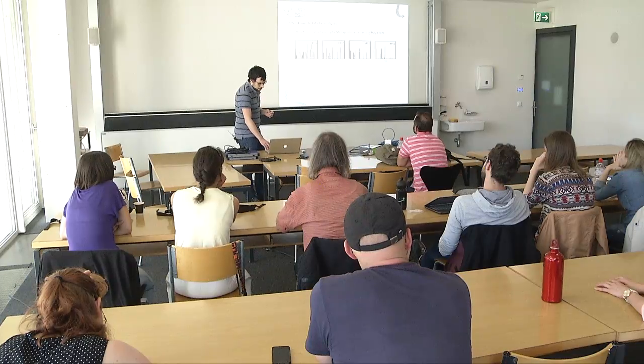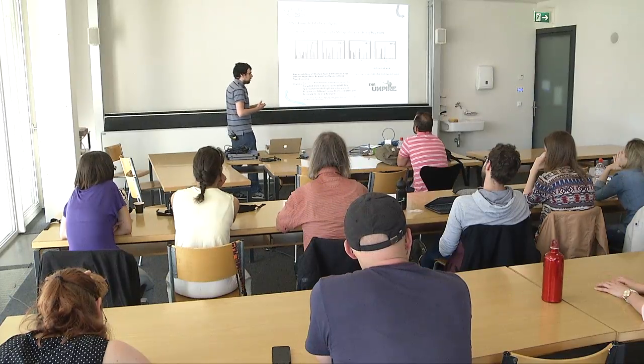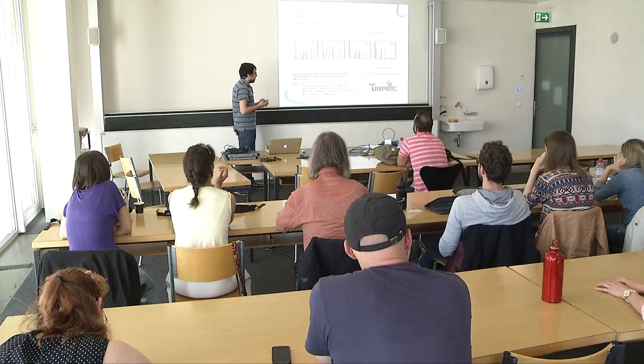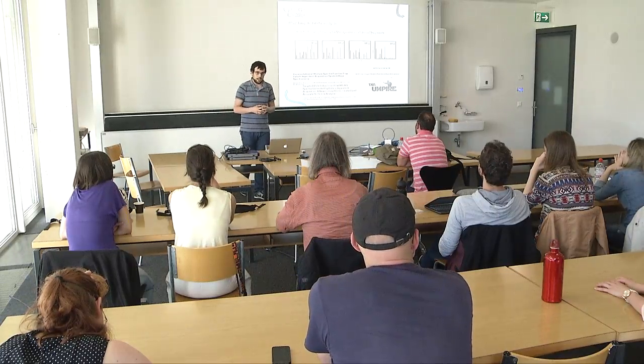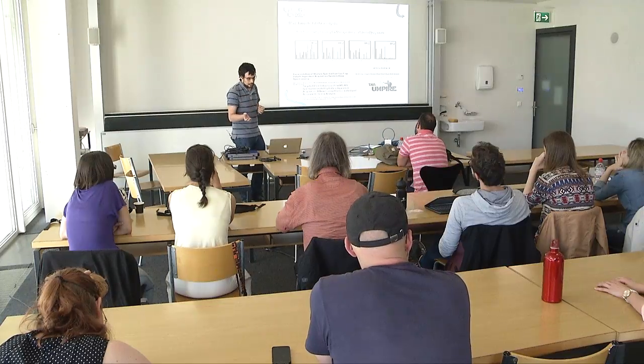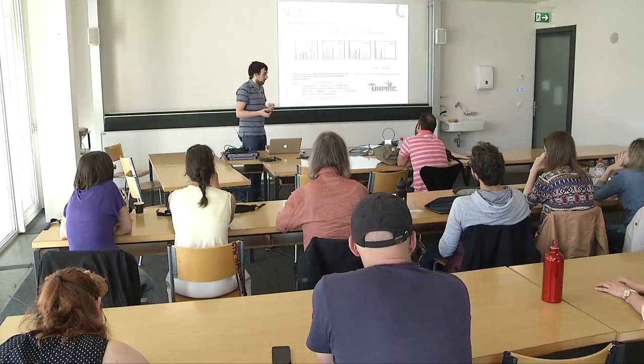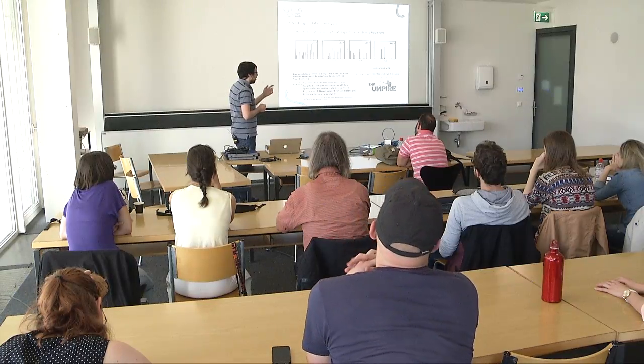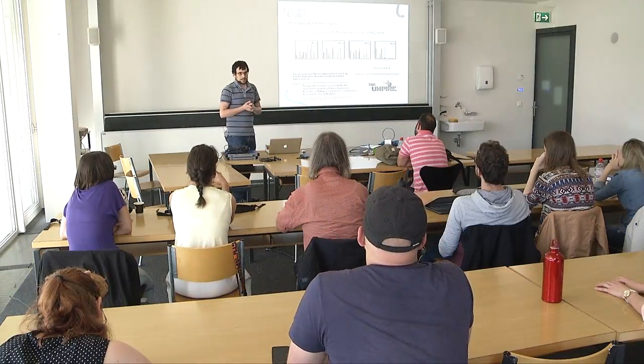And it has been mentioned, especially in Jared's presentation, that there are several ways of extracting this data, right? We have seen Skyline, but there is also OpenSwath and others like XDIA, and recently DIA-Umpire.